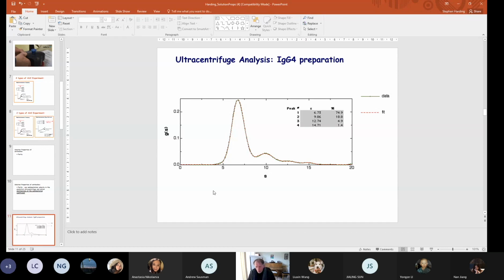So what the company would be trying to do would be to find some form of a stable preparation where there was only one monomer peak. So this value would be 99.9%. And this is the sort of thing which a company would have to present to the FDA, the Food and Drug Administration, to show that they had pure antibodies which could be injected into a patient.